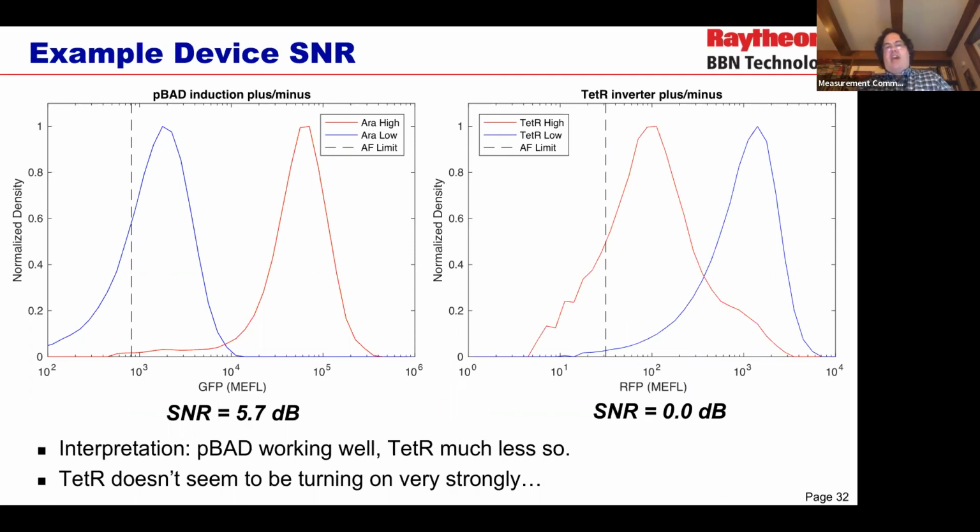And because we've calibrated this into absolute units, these equivalent fluorescein units, we can also start making some guesses about what might be going wrong. Because these units, molecules of equivalent fluorescein, are pretty close to molecules of GFP. And since we're working in E. coli, we know how many molecules are reasonable to try and get. We can try and get 10 to the 5th molecules pretty easily within an E. coli, which has about 2 times 10 to the 6 molecules all told of protein.